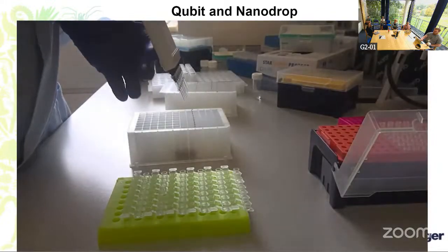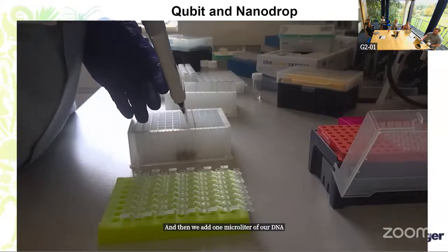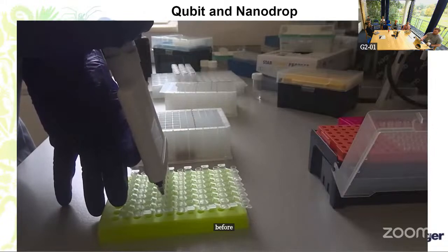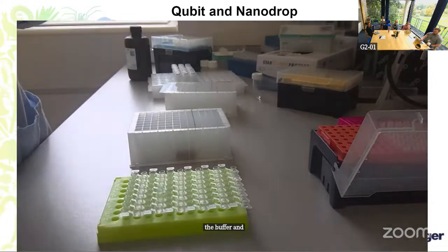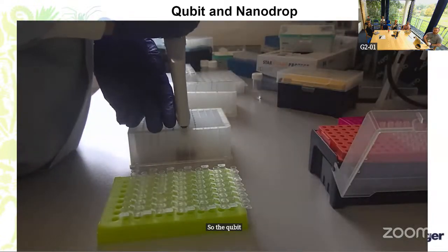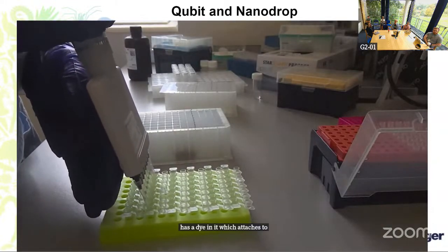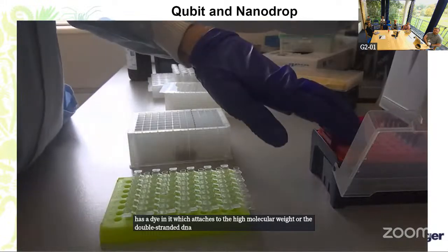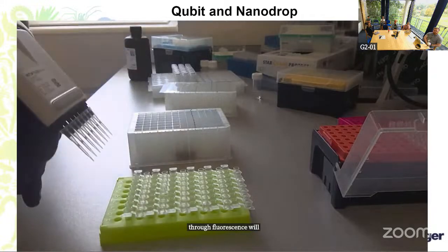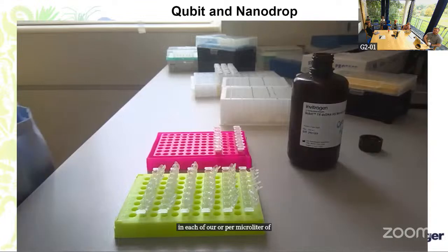And then we add 1 microliter of our DNA to each of the sample tubes before adding the buffer and dye mixture to each of the samples. So the Qubit buffer has a dye in it which attaches to the high molecular weight or the double-stranded DNA, and that will, through fluorescence, tell us how much DNA we have per microliter of sample.